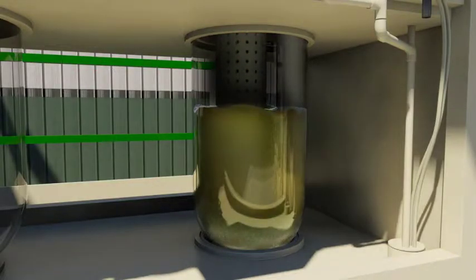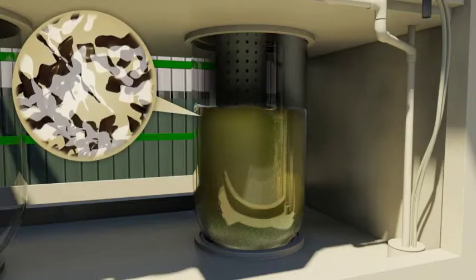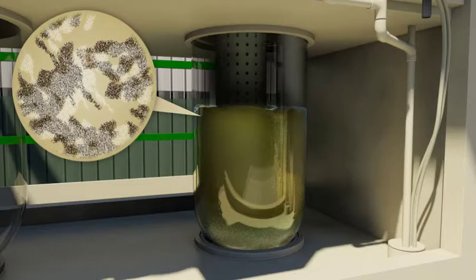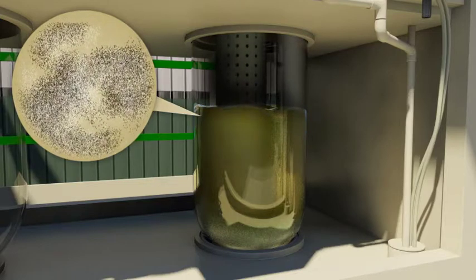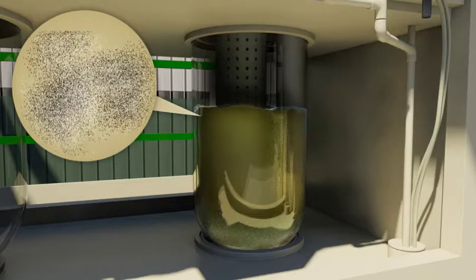While the Aqua Regia reaction goes on, gold dissolves in the mixed acid, whereas silver gets converted to silver chloride crystals, which are white in nature. These white crystals tend to form a surface or a shield around the alloy. Over a period of time, this shield covers the surface of the alloy, which restricts the percolation of Aqua Regia mixed acid to attack the alloy.